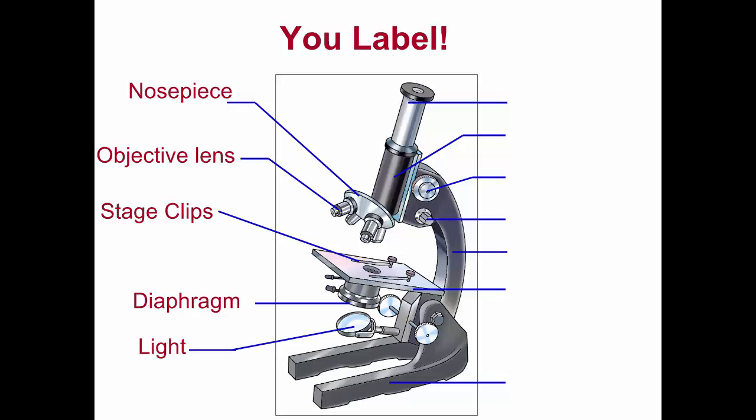Let's go back up here. The part you look through. We just named it a second ago. Natalia. Eyepiece. The long part that lets light go to the eyepiece. Lindsay. The body tube.